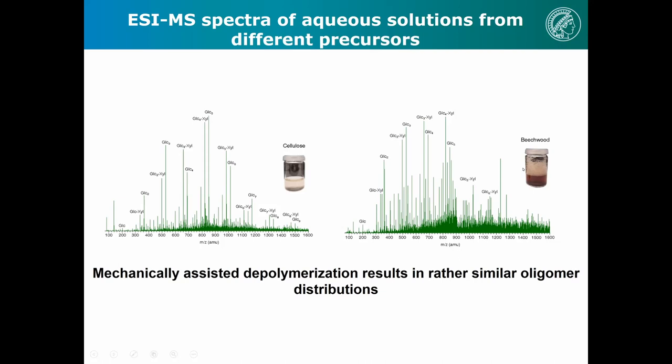And it's a bit foamy because of the lignin. Depolymerized lignin acts like a surfactant. It's actually partly the reason why you sometimes have foam on little creeks in the fall. That's typically not washing powder left over there. This is natural products from the decomposition of the lignin.